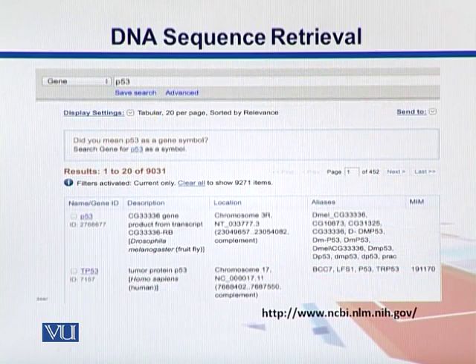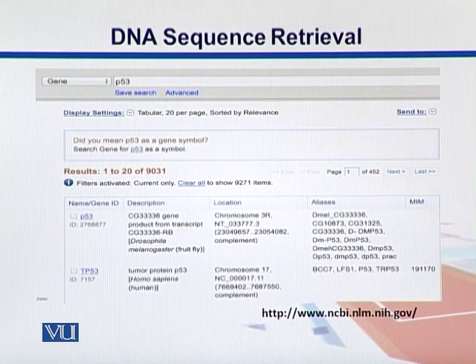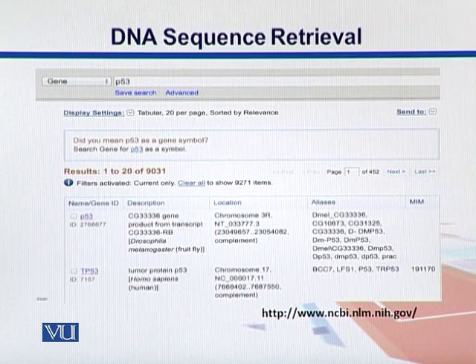Here is the webpage of NCBI. For example, I want to search for my favorite gene P53, which is basically a tumor suppressor gene. So mostly people who are studying cancers must be aware of it. I put P53 in the search box, then click on the go button and here we get the results. We can find many ID entries — over 9000 entries are there.